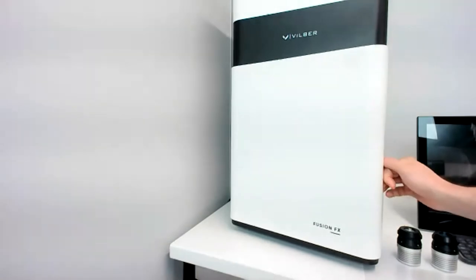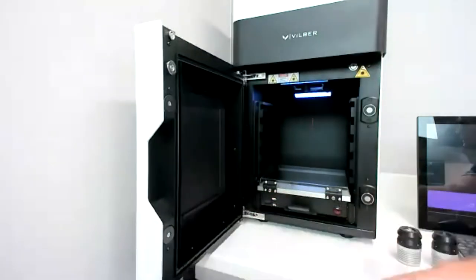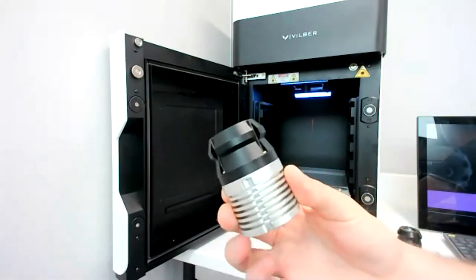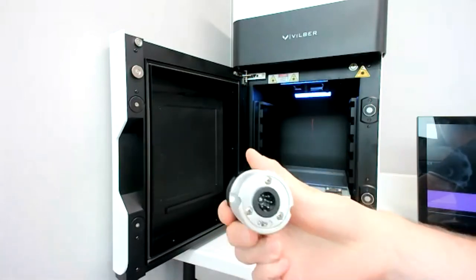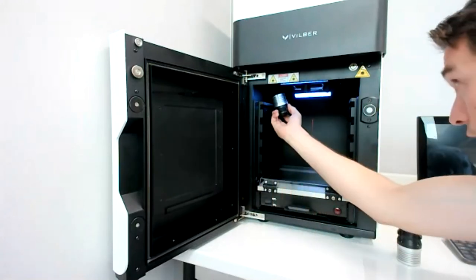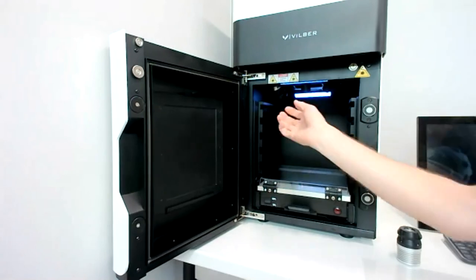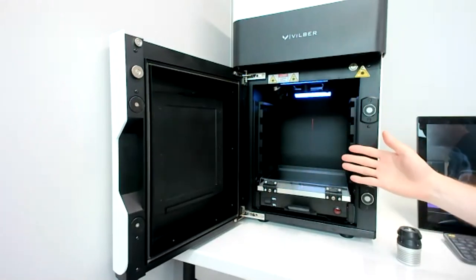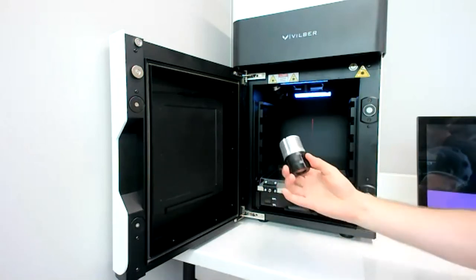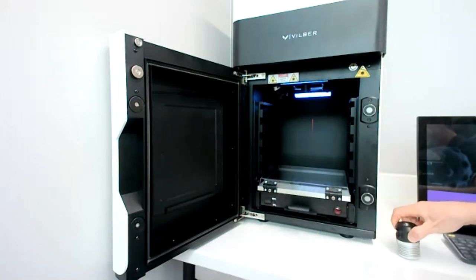And if I switch the camera to the system, you can have a closer look. So this is the capsule I was referring to earlier about the fluorescence illumination. The capsules are plug and play, and you can simply connect the capsule inside, and it's automatically recognized by the instrument for fluorescence applications. You can load a second capsule if you want to do multiplexing acquisitions.